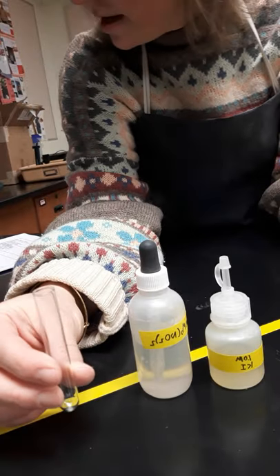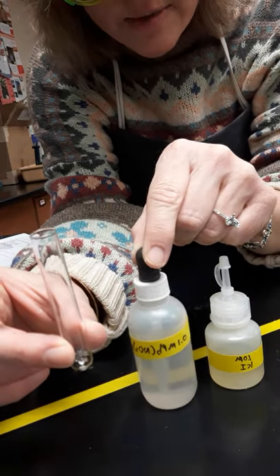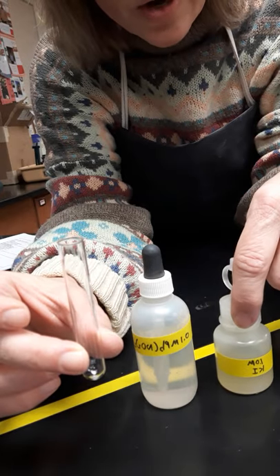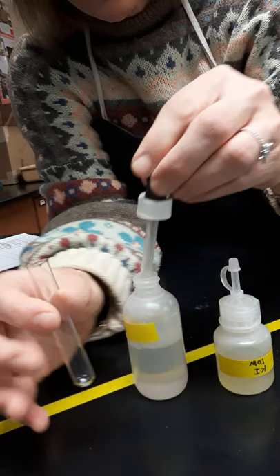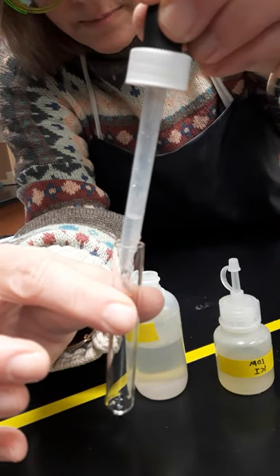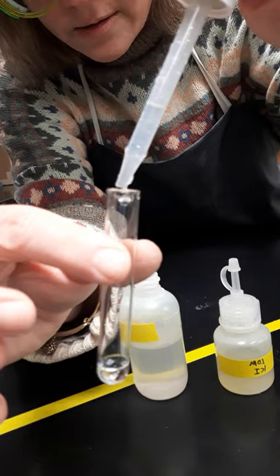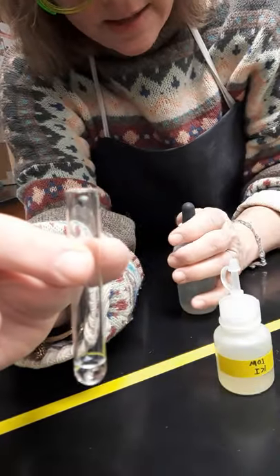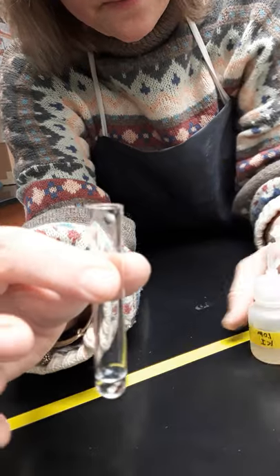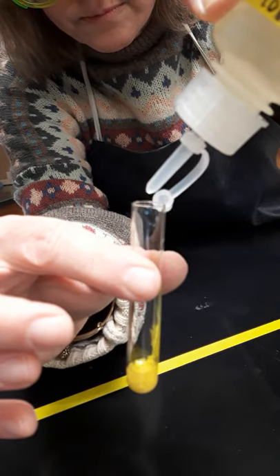For reaction three, we are to put 10 drops of lead nitrate into a small test tube. Here's my test tube and here is my lead nitrate. Then I'm supposed to add 10 drops of potassium iodide. I've got about eight drops in there — nine, ten. Being careful not to touch the nozzle of my bottle, I'll put in 10 drops of potassium iodide.